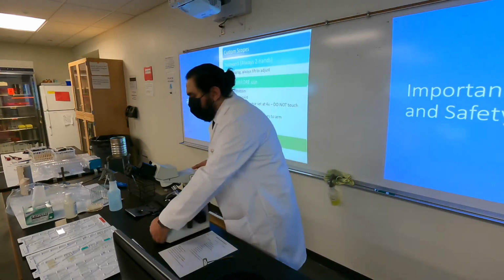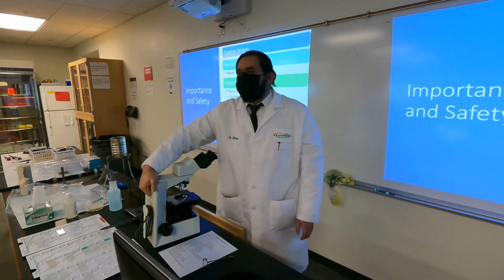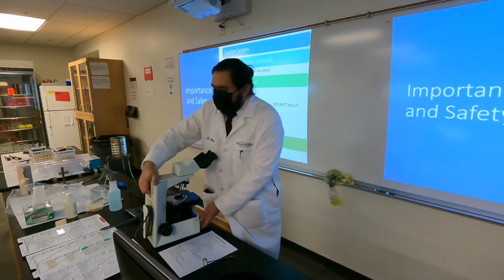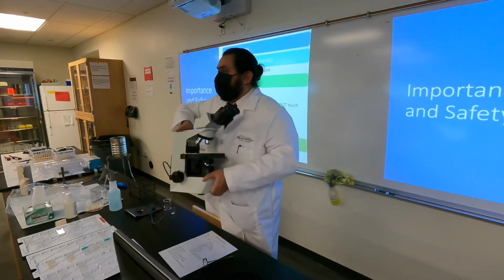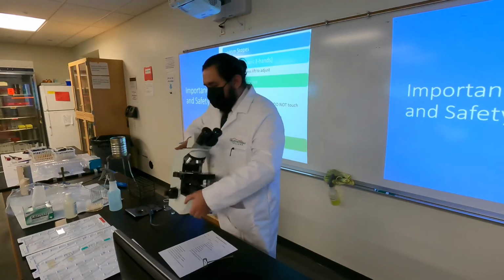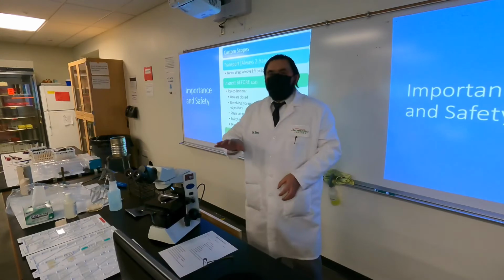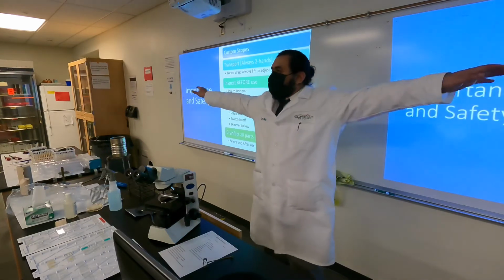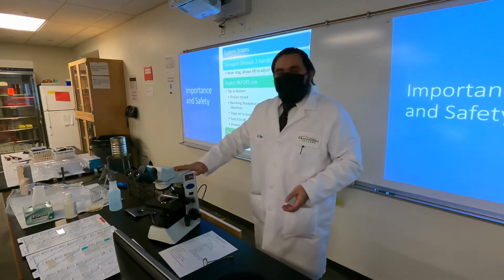Now, there's a way to transport them. You'll notice that there's a little divot in the back so you can put your main hand, and there's going to be a divot in the front so you can put your other hand, so you can always carry this with 2 hands, right? Now, the key thing is, again, it just so happens that your scopes are on your benches, so you don't have to transport them, but when they're in the cabinets, you'll have to take them out and put them back in the same way.